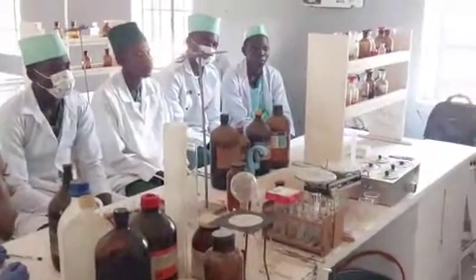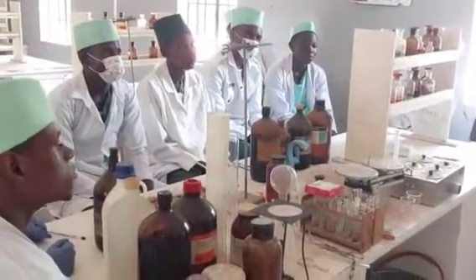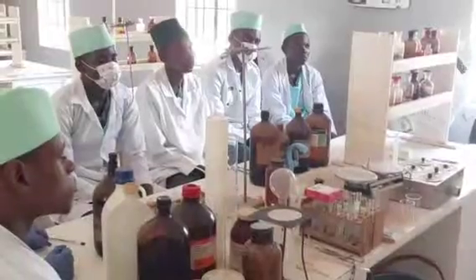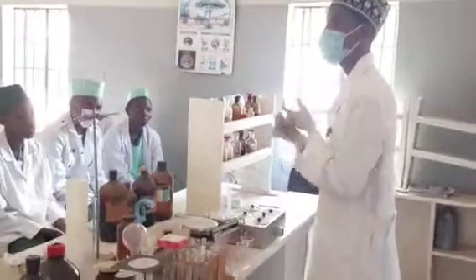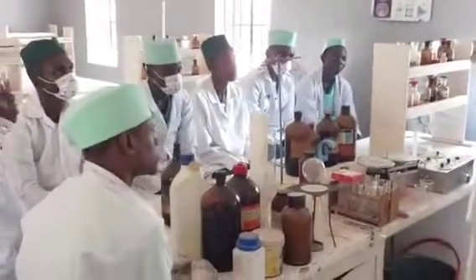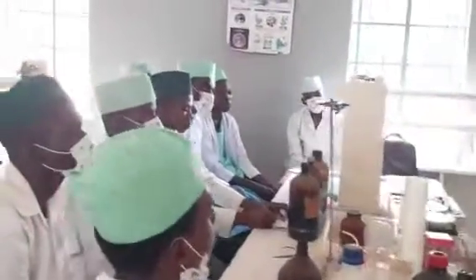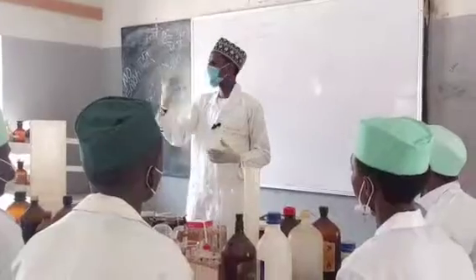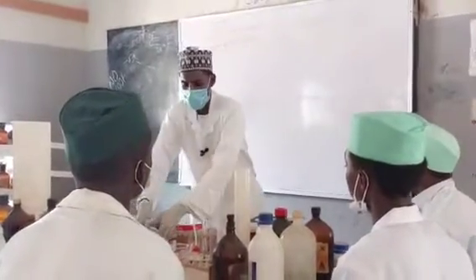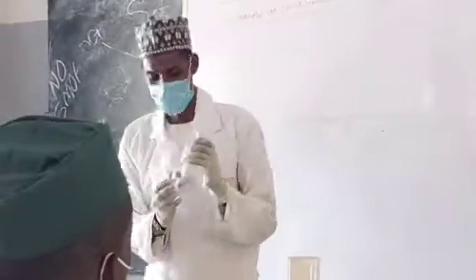The last but not the least, what I want to say is even the glasswares. We have two types of glasswares. There are those that can be used for heating, and those that you cannot use for heating. It is very important. If you use those not meant for heating, in the case of heating a reagent or any reactant, there will be breakage. Those meant for heating, in most cases, are labeled, like this one.